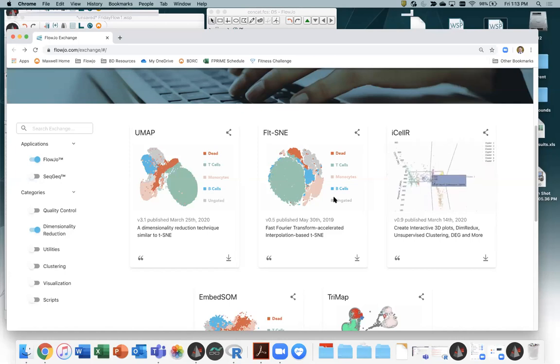Okay, so then UMAP was the first alternative to t-SNE that works in a fairly similar means. UMAP stands for Uniform Manifold Approximation. So a manifold is just an estimated shape, well, a shape within a mathematical space, a high dimensional space frequently. And UMAP attempts to estimate that shape and then maps the shape down to a low dimensional space. And so it's very similar to t-SNE in that there's still some kind of high D approximation, and we try to make that mapping happen in low dimensions.